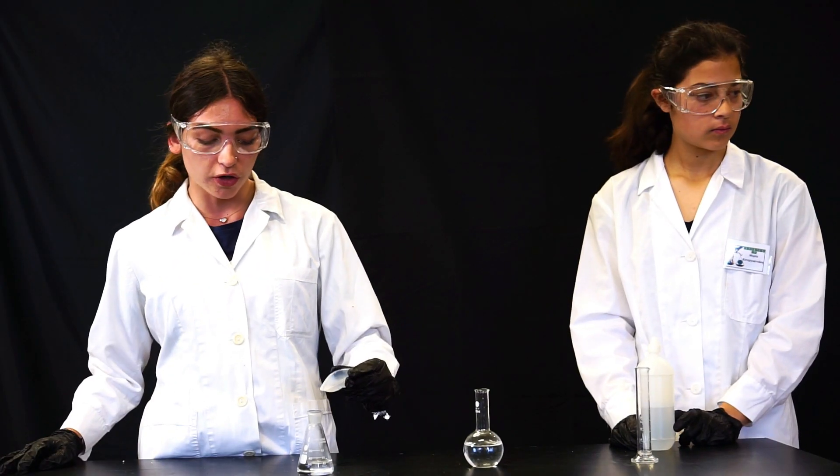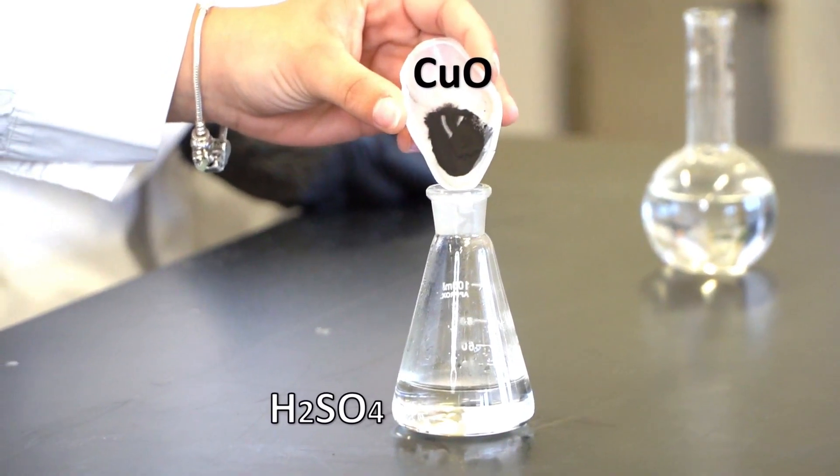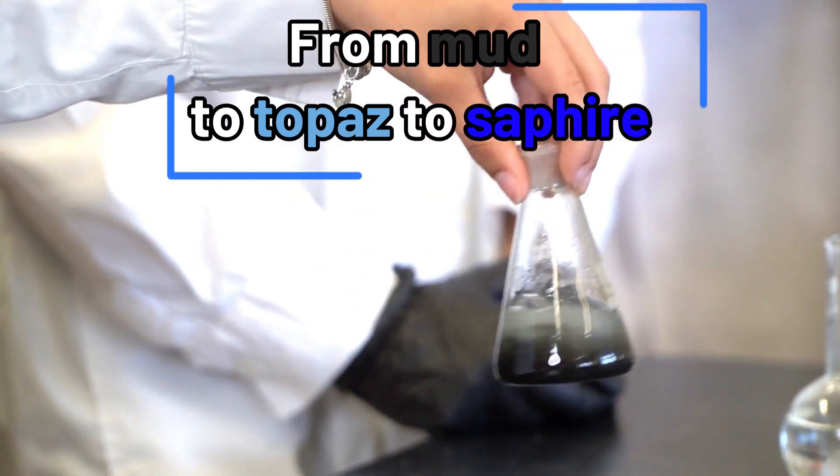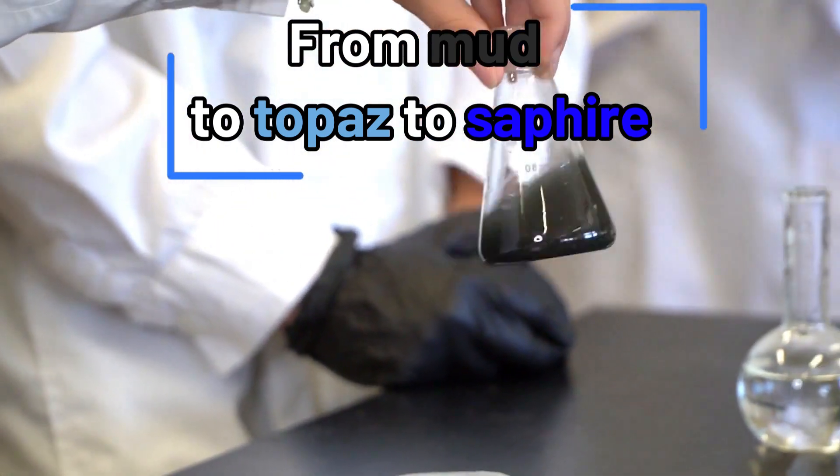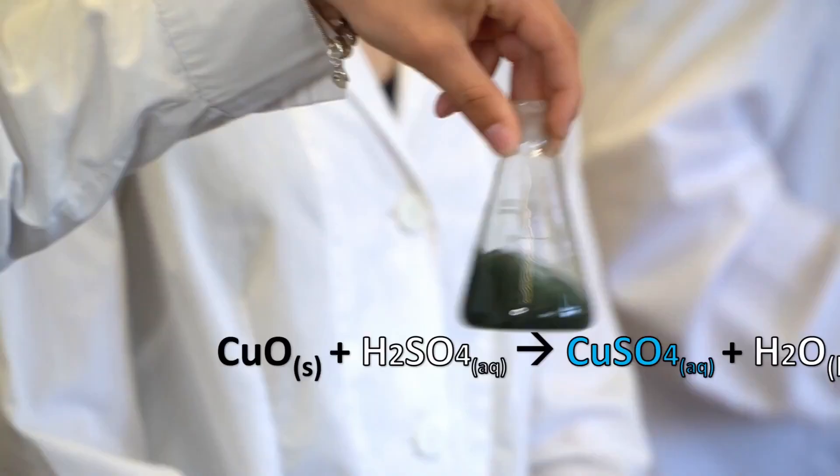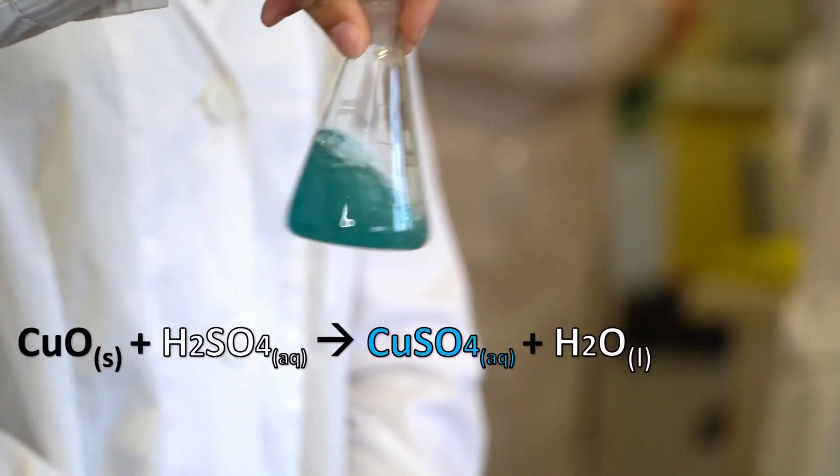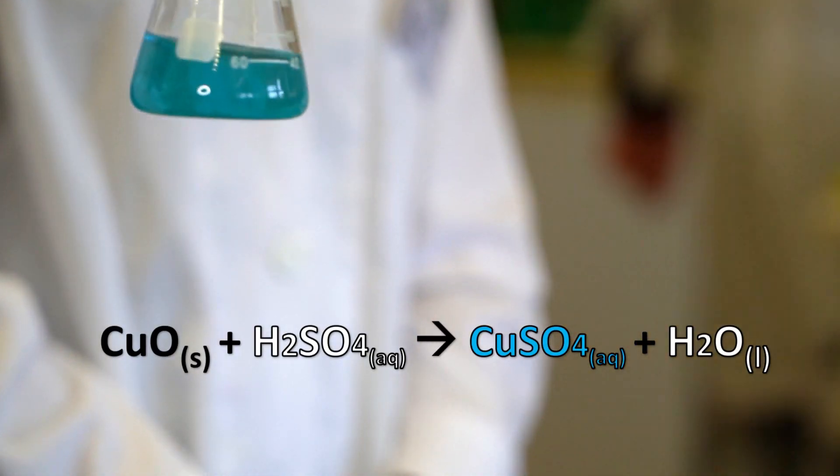Cupric oxide is a black water insoluble solid that reacts with sulfuric acid in a neutralization reaction producing the greenish blue copper sulfate. To speed up the reaction we preheated the sulfuric acid solution.